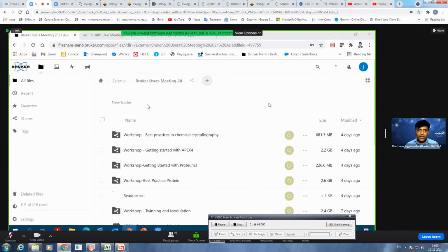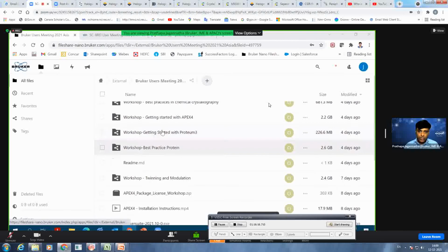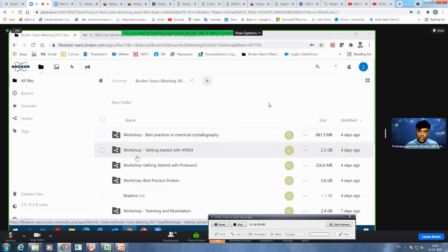So I have sent you the link for this workshop, which gives you access to all these directories, which contain your Bruker software, Bruker suite, Bruker executables, and Python. These 3 software packages you need to install, along with a license. Along with that, we have also put up the video so that you can watch how to install the software. And then there are the workshops: disorder refinement, best practice, getting started. Everything has the data inside.